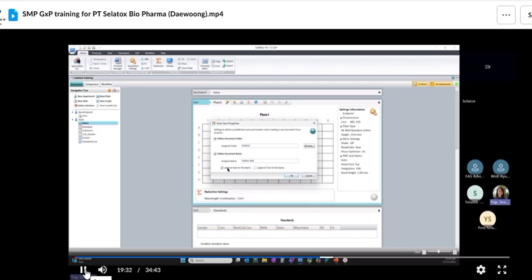So you can assign it with dates as well as the time. I typed wrongly, sorry for that. So you can do that. It's very convenient. The reason is, you don't have to let the other person know which folder to save it in, because different users type the name slightly differently. If you auto save, whenever you run the experiment, it will save according to your auto save naming. So I will save this file automatically as a Selato data with the date as well as the time. You will see that later.